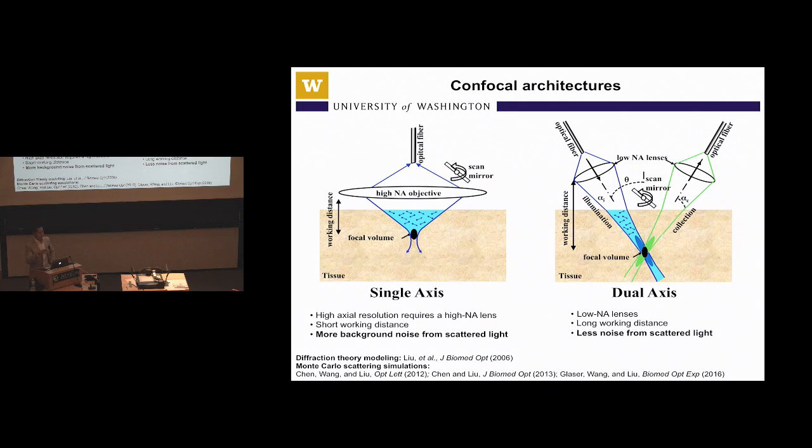So that's the way that a confocal microscope is able to reject the out-of-focus light, the multiply scattered light, and to generate a clear image beneath the surface if you can scan that point by point in 2 dimensions to create a 2-dimensional image. But it's not a perfect optical sectioning device. There's still a lot of background noise. There's still a chance that some of this out-of-focus light or scattered light can make it back into that pinhole.